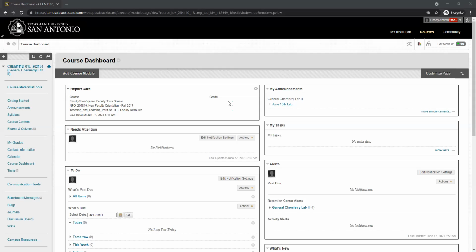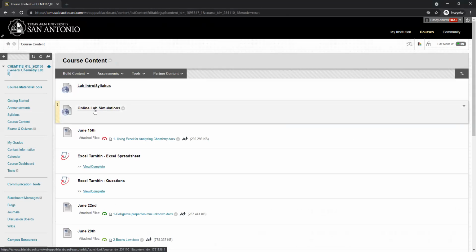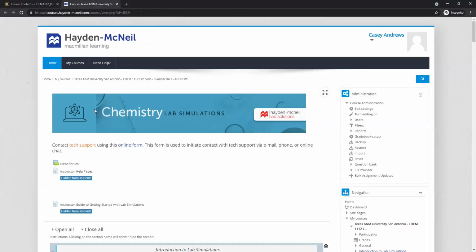In this video, we're going to go over how you access your online labs. Right now, I'm in our Blackboard site, and I'm going to click on course content here. And you want to click on this link, Online Lab Simulations, and you're taken to our online lab course.